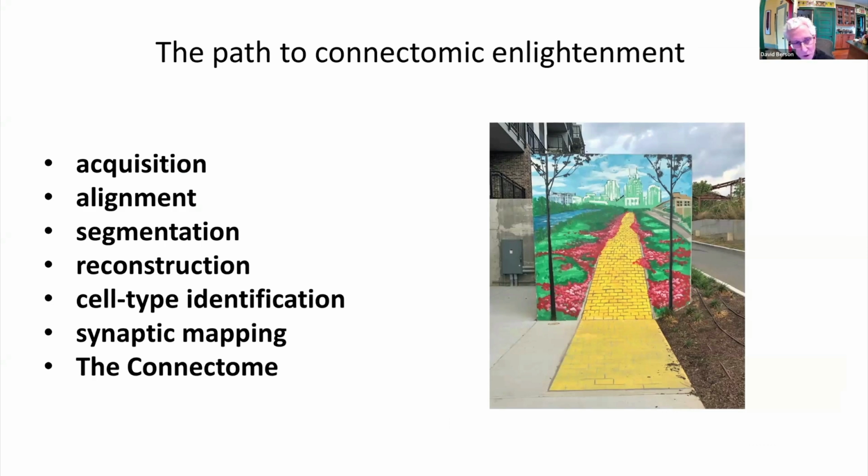And so connectomics is a perfect approach for combining with intracellular recording and for light microscopic methods and molecular methods and so forth to try to really break the whole network down and provide a deep mechanistic understanding of how this machine really works. Obviously, connectomics is a complicated process. It involves lots of stages, and my presentation is going to touch on these to varying degrees.